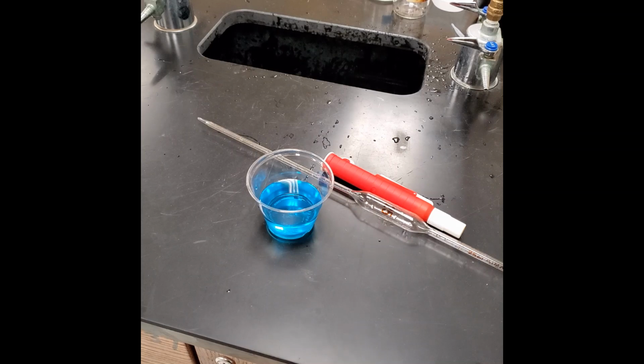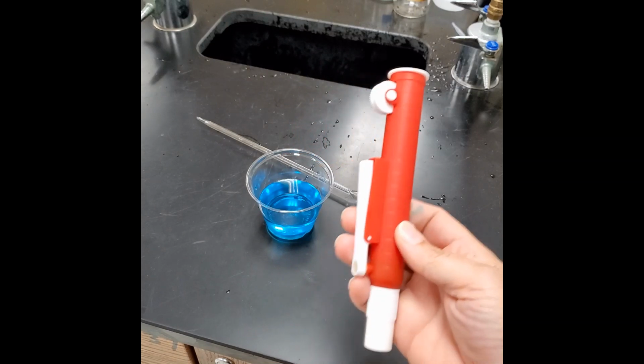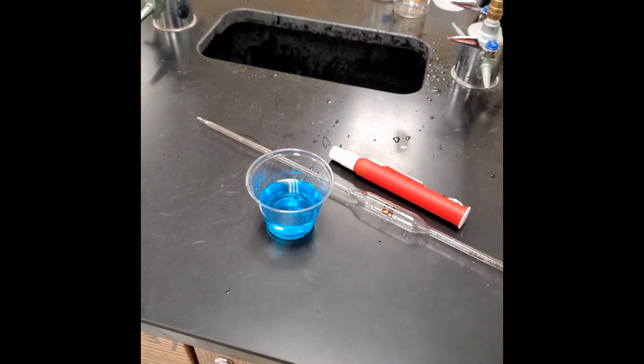Okay, I wanted to just tack on a little addendum to the video because I realized when I showed you how to use the pipette, I was using the filler sort of in a way that it's not designed. I was also out of habit of how I learned to use a pipette with a bulb. We used to use bulbs, and you would definitely have to pull the bulb off and use your thumb. The fillers are designed a little bit different way, but over the years they don't work as well as they should. So I want to show you how the filler is designed to be used, and if you happen to get a good filler, you can actually use it this way as well.